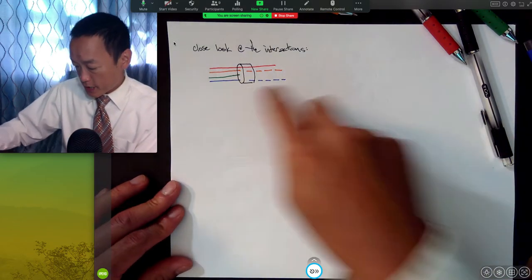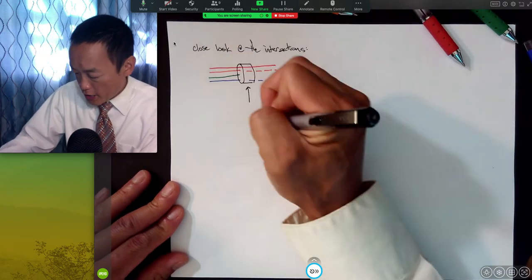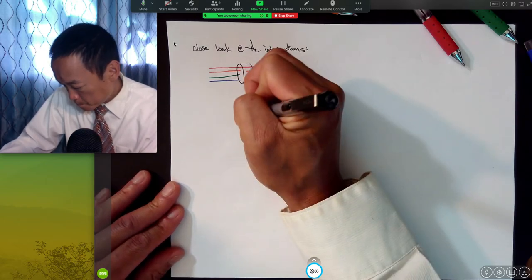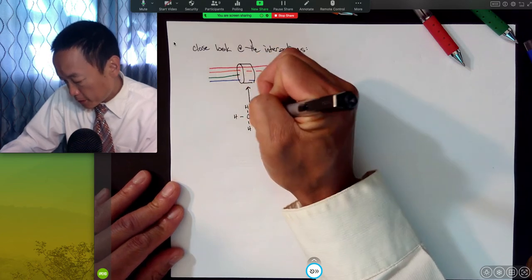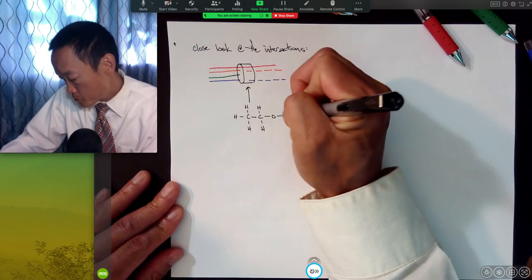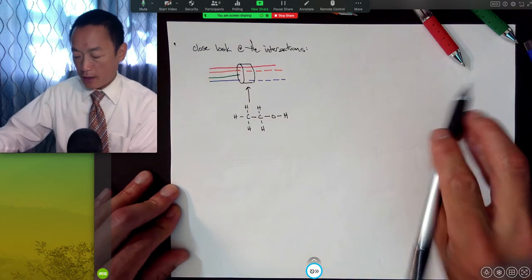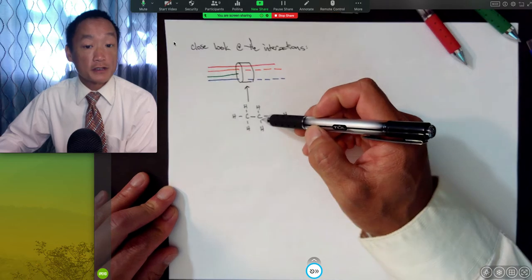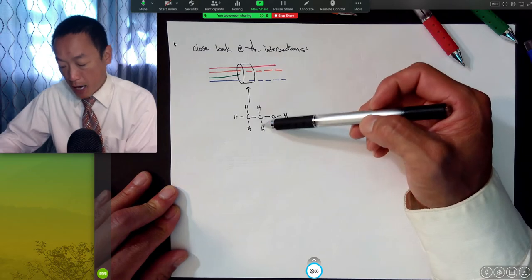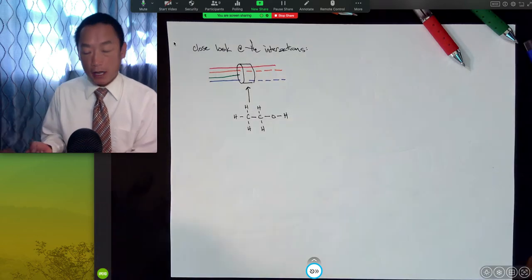Well, if we were to say the sample right here was a molecule of ethanol, which I'm going to have to completely draw in its Lewis structure, what I'm suggesting is that this light can interact with this compound and get different types of results depending upon whether or not this molecule is susceptible to interacting with that wavelength of light. So how do molecules interact with light?